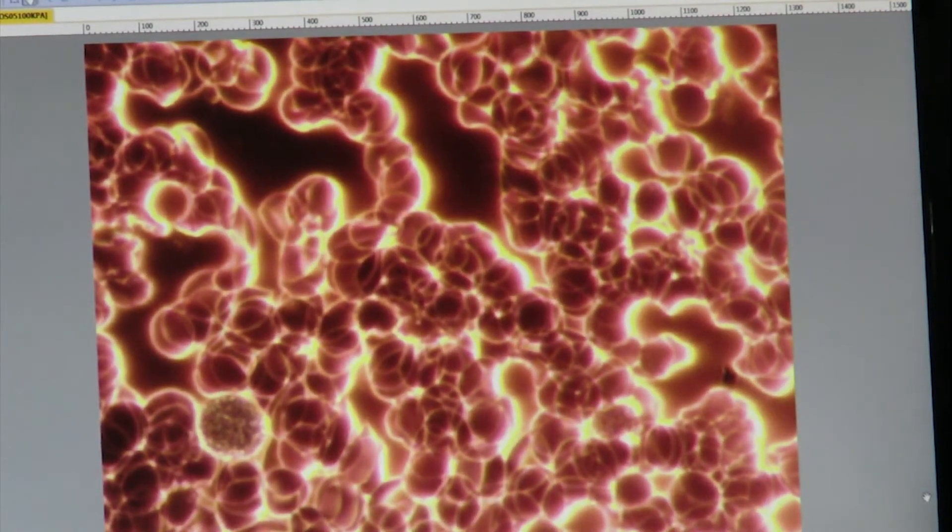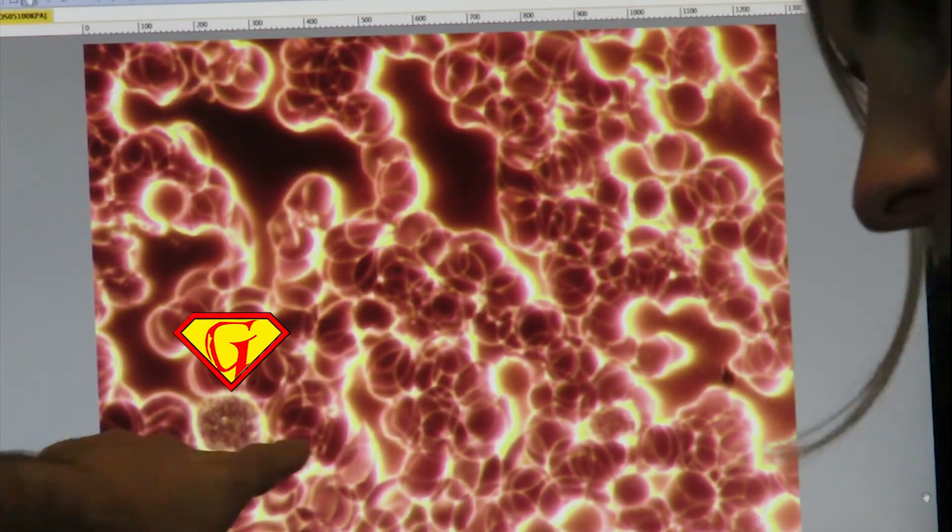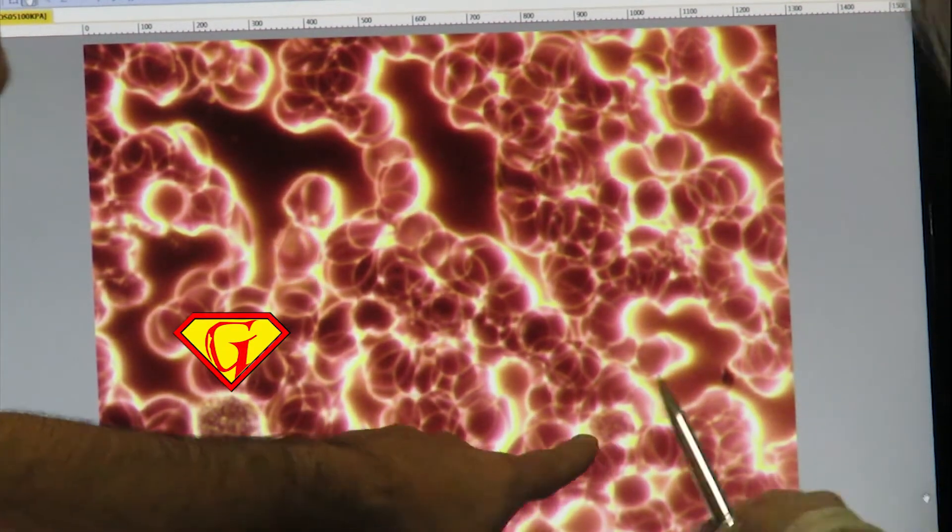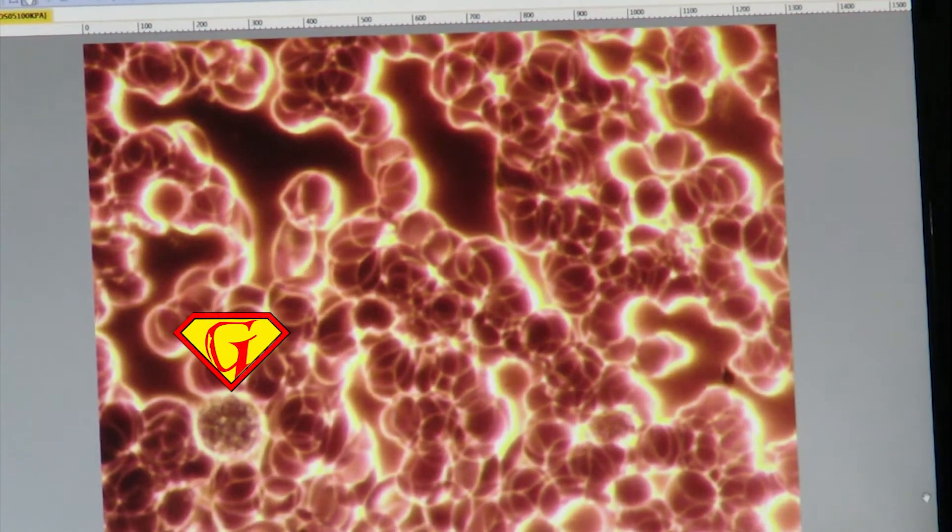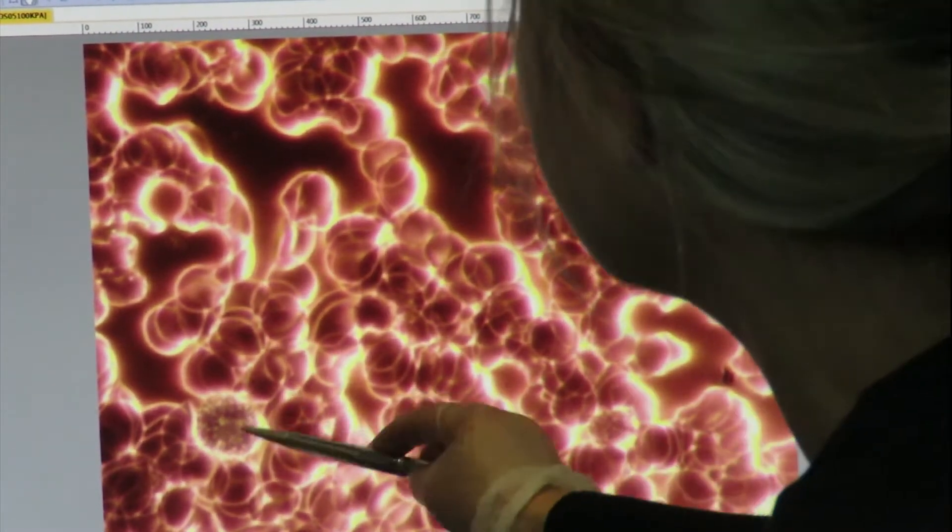That's what red blood cells do. I do know that much. Of course, if the stickier your plasma, the clumpier it's going to be. That's a superhero? You got it. Is that a dying superhero? Nope. Is that Ascarius? That's Ascarius. So this is your white blood cell.